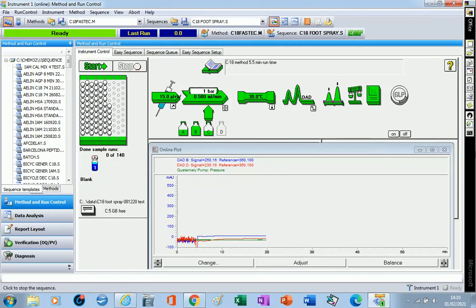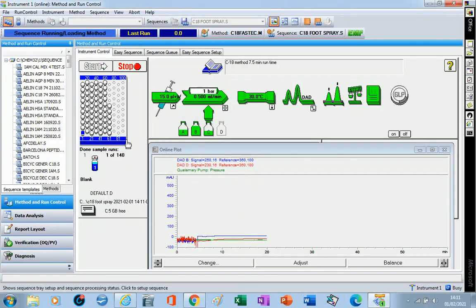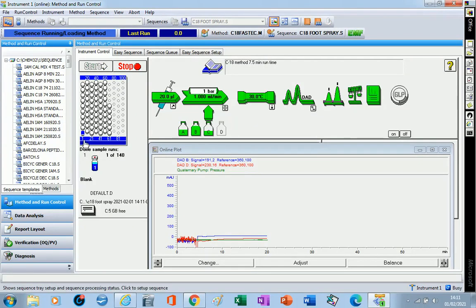switch when you press the start button and change. I don't change that, and look, it filled up all my vials, what I just showed you. And now it's blue, it is working, so now my system is starting to inject.